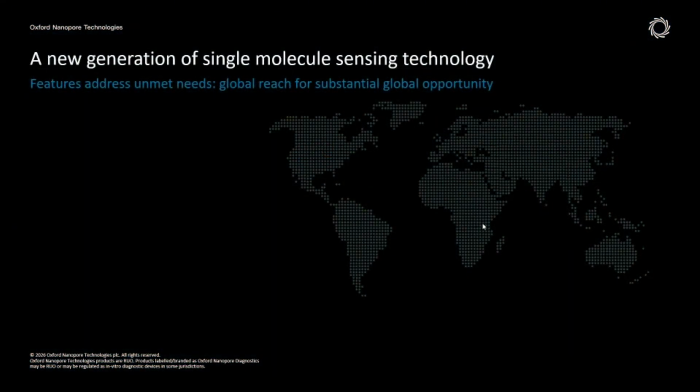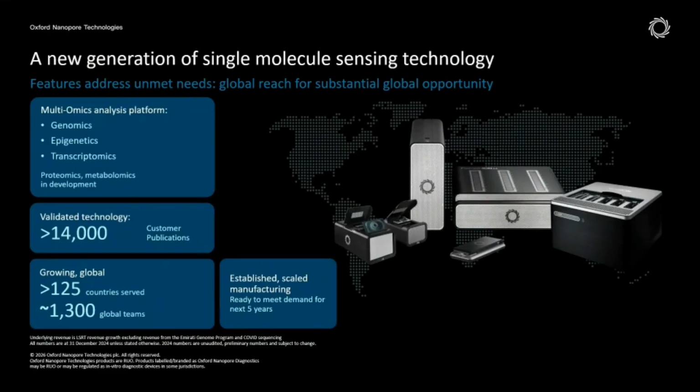We have introduced this in every webinar, but just to quickly rehash again. ONT is a UK-based company who develops and sells the nanopore sequencing products, including the DNA sequencer like the MinION, or some people prefer to call it the Minion, and another type of sequencing machine, the PromethION, which is a larger scale nanopore sequencing device. The technology is able to sequence DNA molecules at the single molecule level, and it's real-time sequencing, so we can get the data while the sequencing is still ongoing.